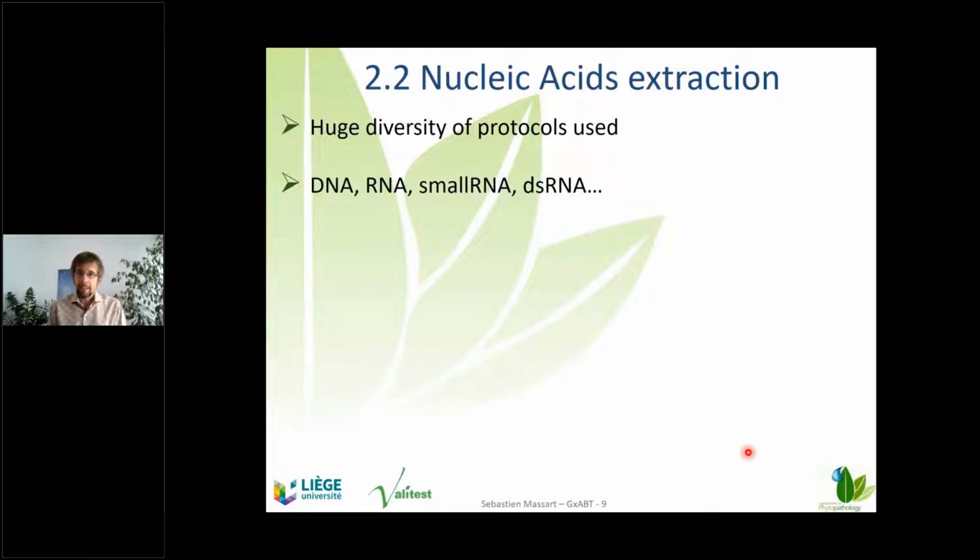For nucleic acid extraction, whatever your topic, you might be a virologist, a bacteriologist, a mycologist, a nematologist, whatever, there is a huge diversity of protocols used. If you have a look at the literature, you can start from DNA, the genome. I want to sequence the genome of my pathogenic bacteria. I want to evaluate the species of fungi that are in my spore trap.